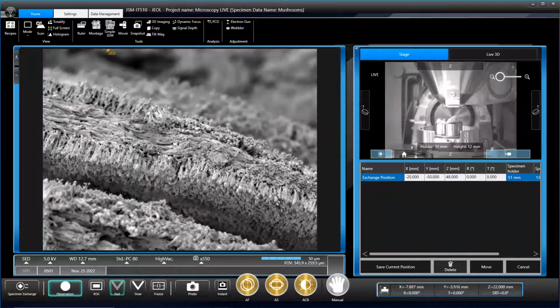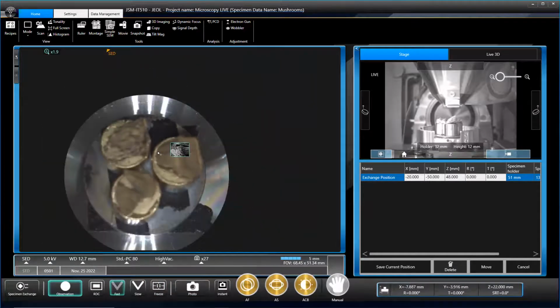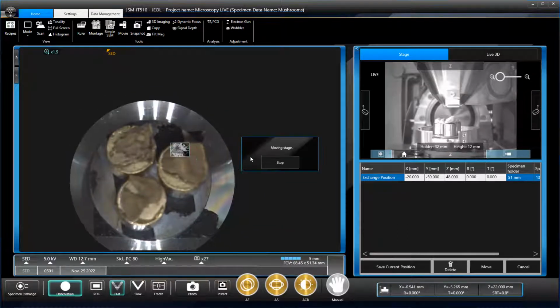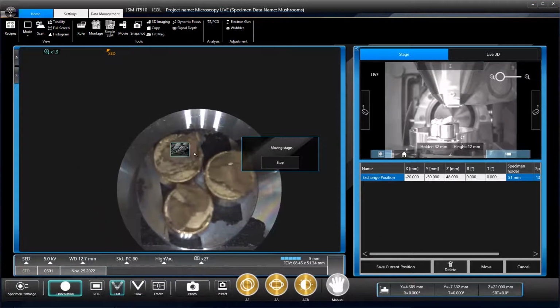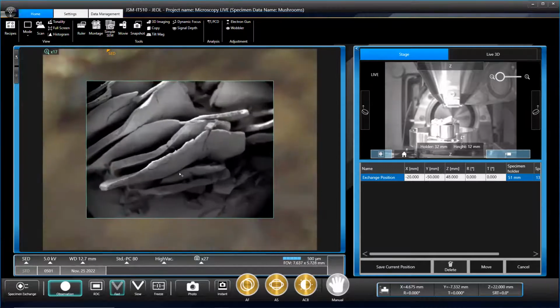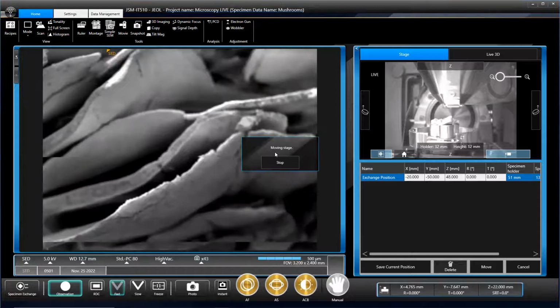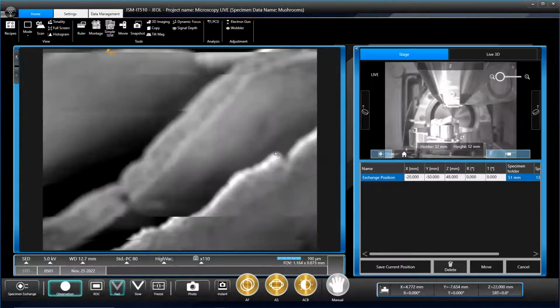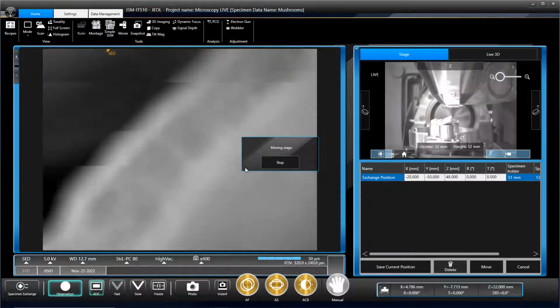So at the top left, yes. They look very different just holding them. It'll be interesting to see if that carries across. I guess all your three species here have gills, but you can also have mushrooms that have pores on the other side. They're just lots of little holes, and that's what produces the spores. So you've got your boletes, which can be a tasty one, but you also have very deadly lookalikes. So it's a risky one again.